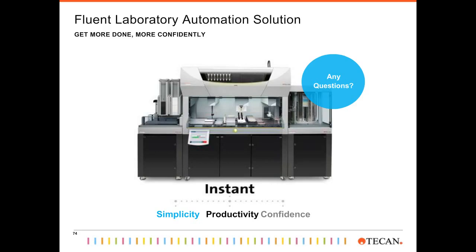Yes, so thank you, software geek, whoever you are. API is an application programming interface, and yes, Fluent Control has an API. It's a fairly simple one, but you can use it to remotely start scripts and interact with the system and variables. There's an example Excel spreadsheet delivered with Fluent Control that shows off this functionality. And if you're curious, I would actually be happy to personally give a demo at some point in the future.